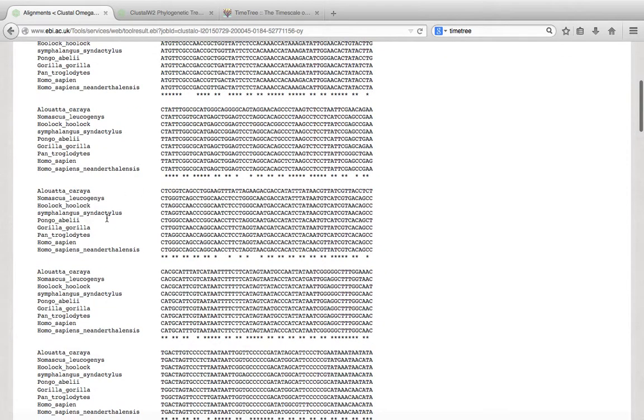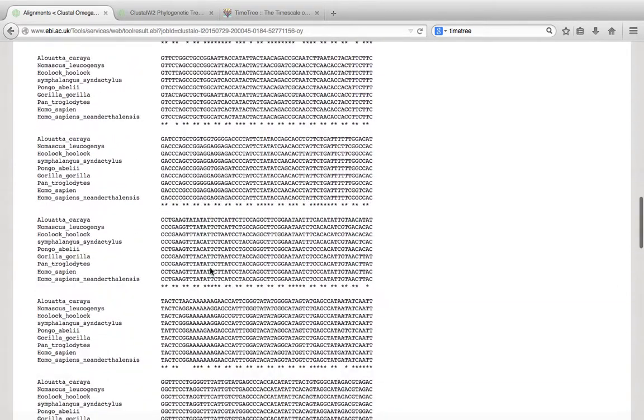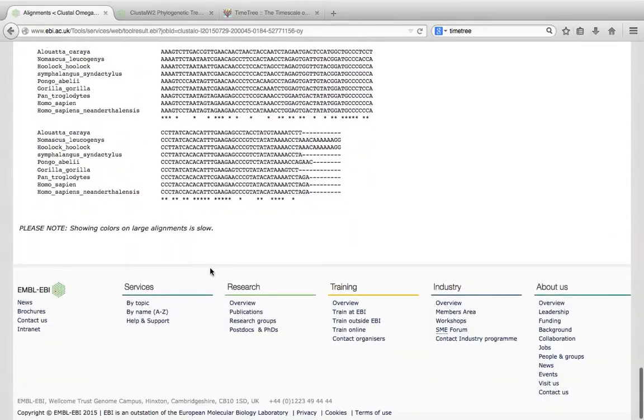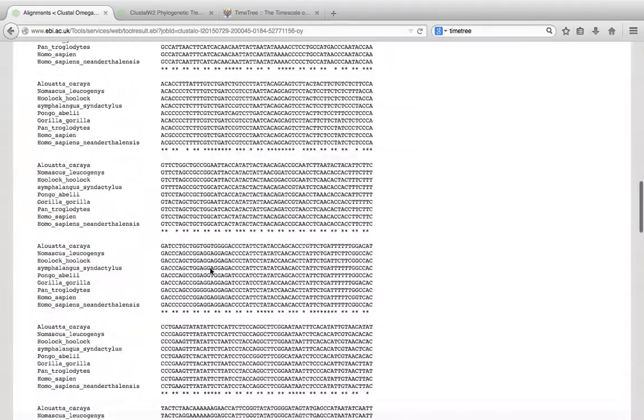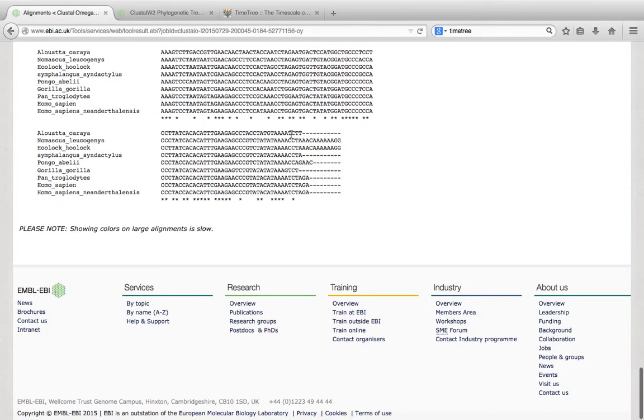Bear in mind that analysis may take longer depending where in the world you are, how good your signal is, how good your Wi-Fi is, how many of you are doing this at the same time. Because I'm on my own, it was very quick. So you'll all see it's all beautifully aligned. That's wonderful, that's a good sign. Except for this bit here.